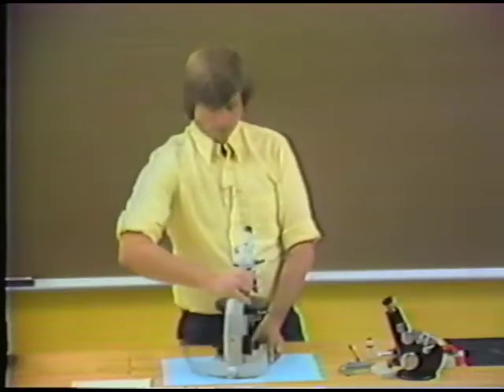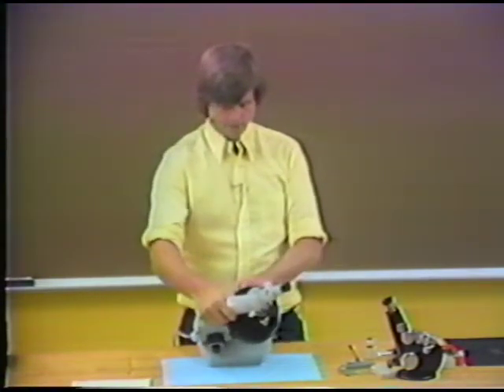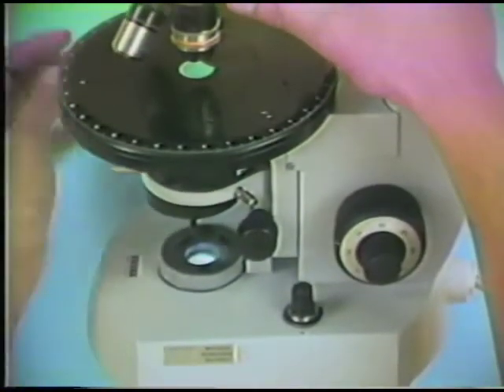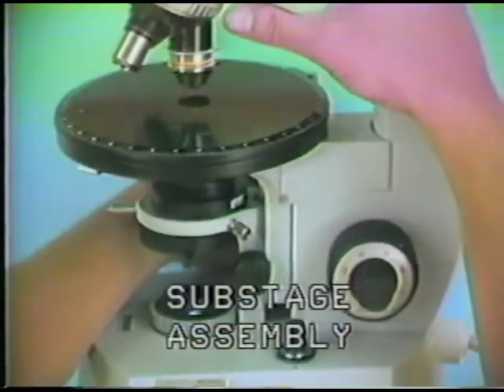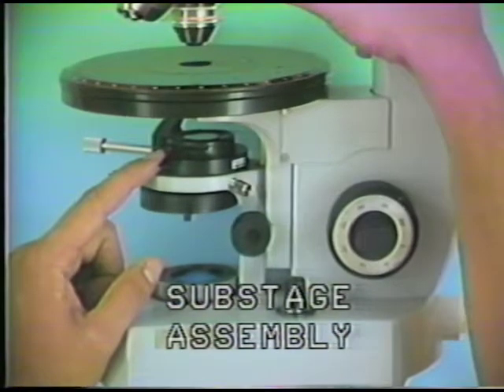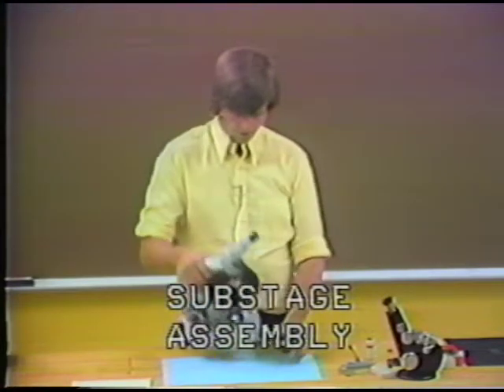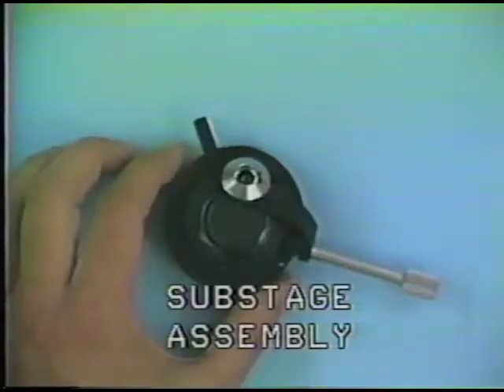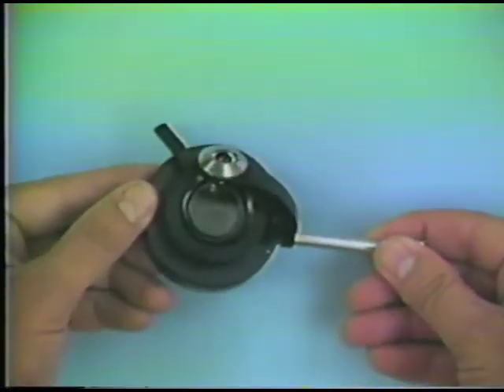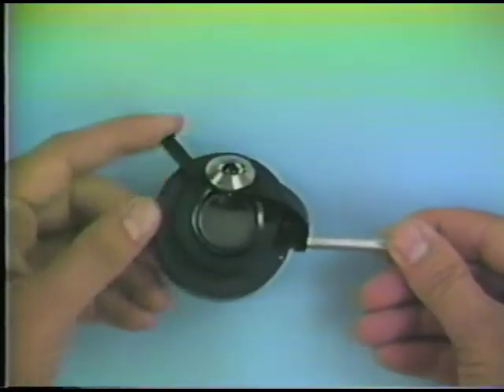Okay, the next thing I want to point out to you is something that's found below the stage of the microscope. This is the substage assembly of the microscope, and it's located right in this position here, just below the microscope stage. Now I've taken one out of another microscope which I can show you quite readily, and so I have it right here. This fits just above the rest of the substage assembly, and it really consists of two parts.